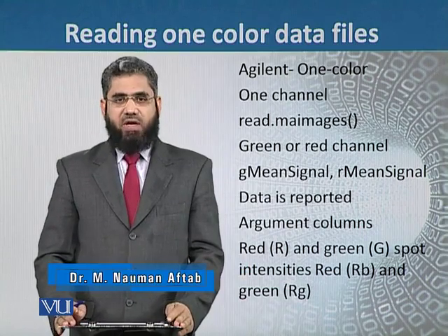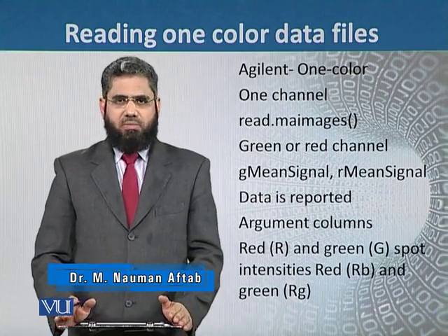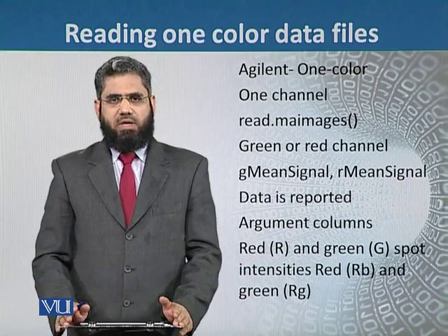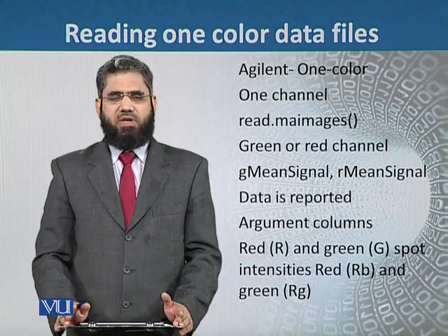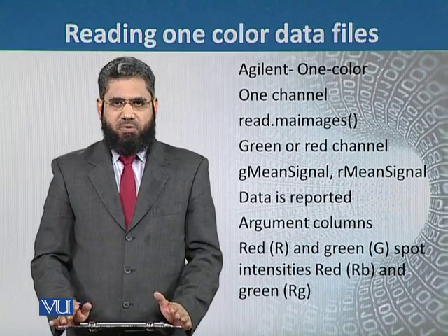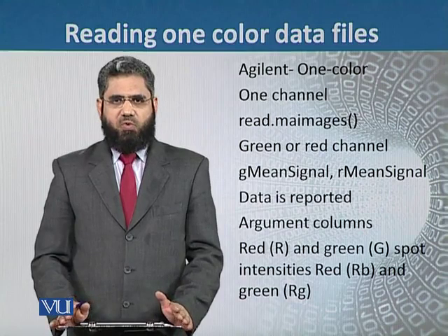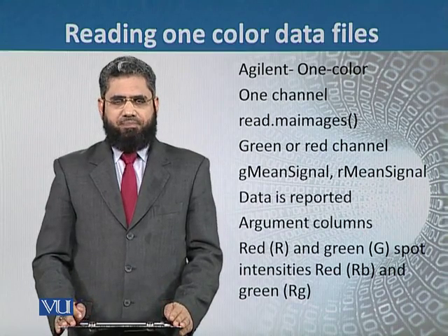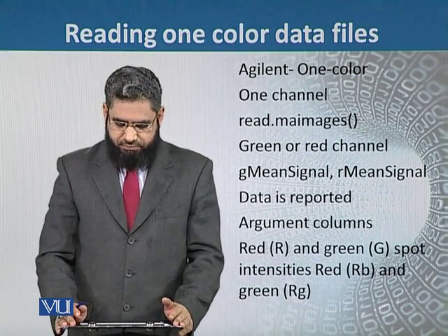So in this case we have to use some tricks to make the program think that we are using two color data instead of one color data. There are certain procedures that we can adopt, and we can force the program to analyze our data even if we are using one color or one channel data.